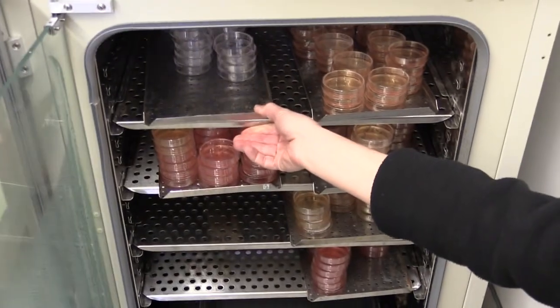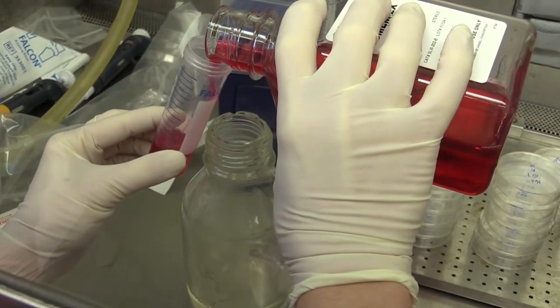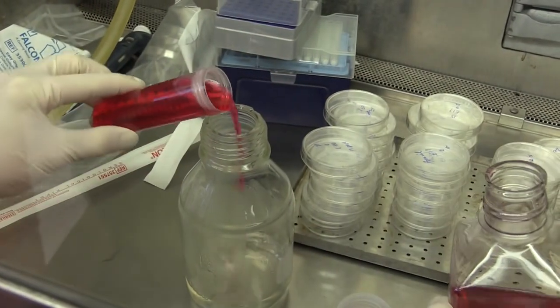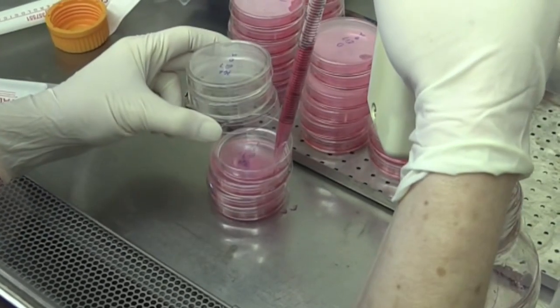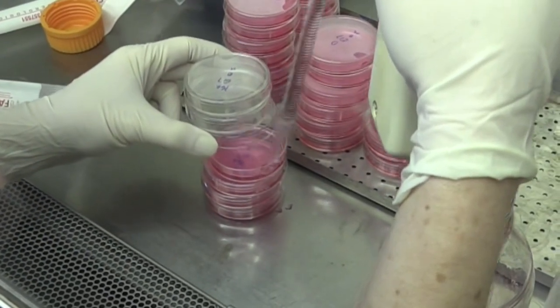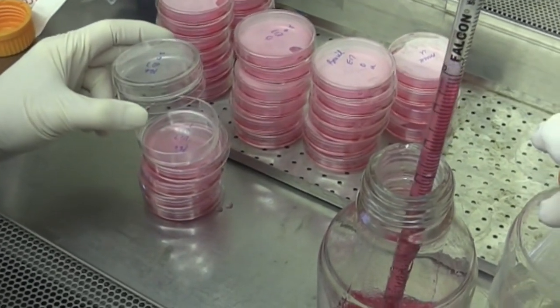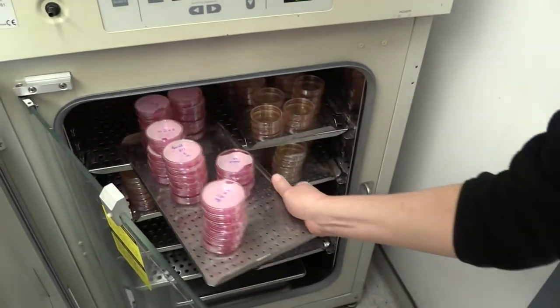When the virus adsorption time is over, we mix the agar solution with our cell culture medium, which has also been warming up at 45 degrees Celsius. We then add this mixture to each cell culture well. The plates are left at room temperature in the cell culture hood until the agar solidifies. Then we place them in the 37 degrees Celsius incubator.